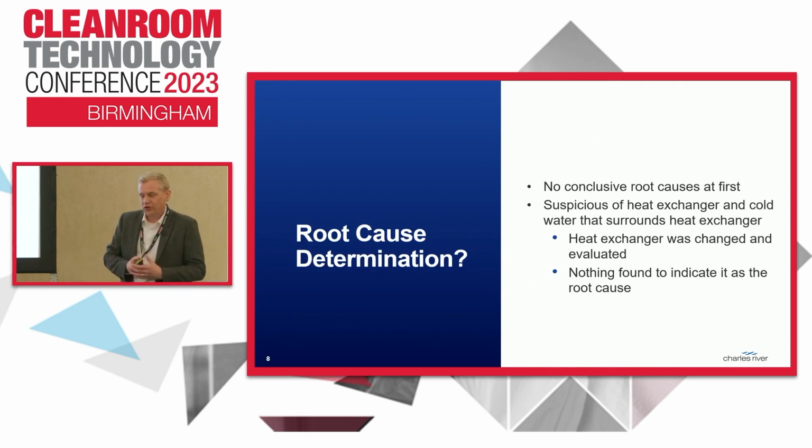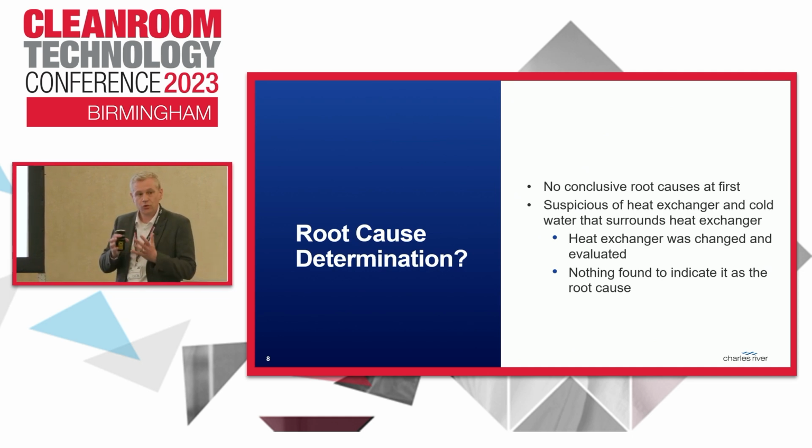What was the root cause determination? Well, unfortunately, they couldn't determine a root cause. They were suspicious of the heat exchanger and the cold water that surrounds it, but they changed the heat exchanger, as I said, and after evaluation of the unit, they found nothing to indicate that it was the cause of their issues.